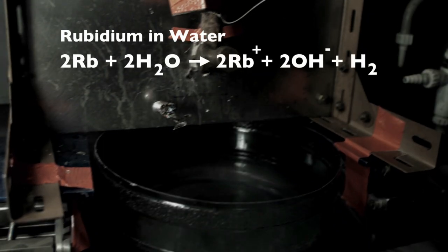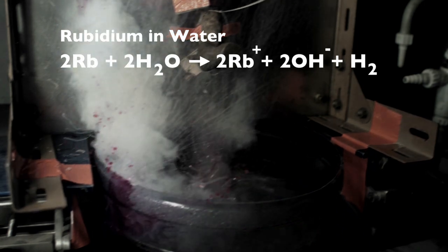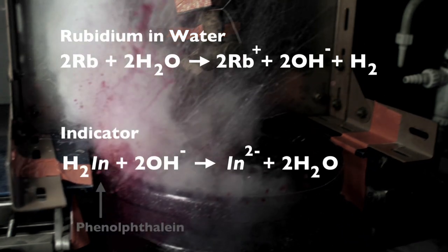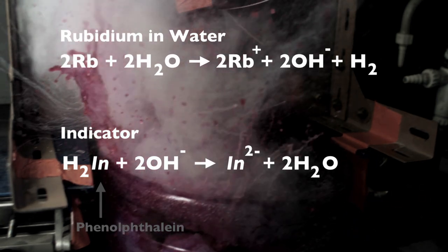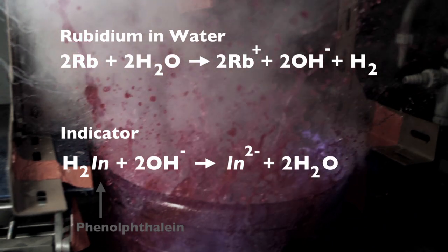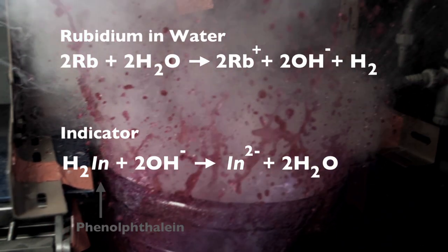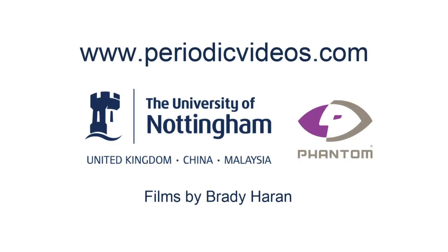The reaction takes place very much faster than the speed of our camera. The rubidium hydroxide is reacting with the acid — the colourless indicator — to make rubidium phenolphthalein plus water. So in effect, H⁺ is leaving the acid and reacting with OH⁻ to give water.